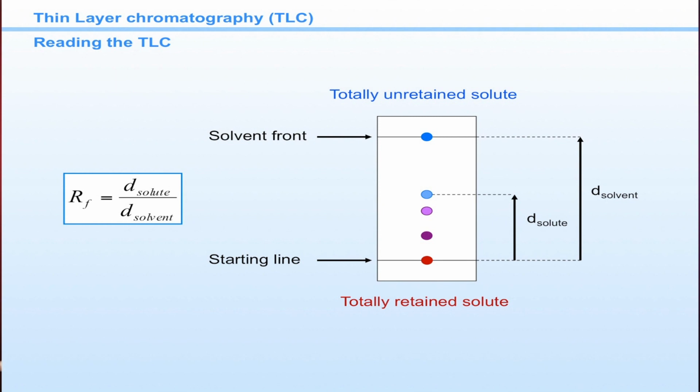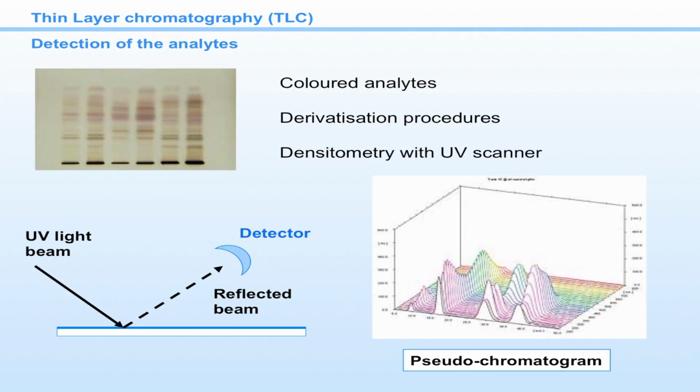Like this, the components which are separated are identified and detected and further employed for the continuation of research work. The application is mostly for the separation of components, for finding out any drug or any pigment, whatever it may be. You can see whether your sample has a single compound or multiple compounds. Now apart from this, your other chromatography techniques, that is column chromatography, ion exchange chromatography, gel permeation chromatography, which come under the examples of liquid chromatography, and the other one is gas chromatography, where I am going to talk about gas liquid chromatography and HPLC.